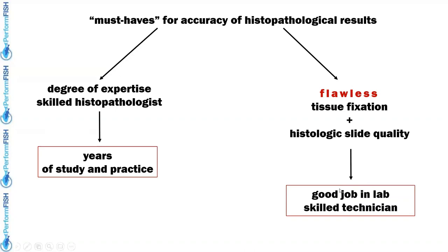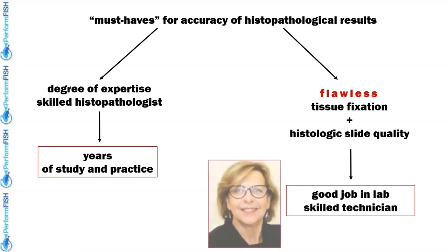And so it's very important to have flawless tissue fixation, good histological slides, a good job in the lab, and a skilled technician. And for our luck in the lab, we have Carla, the super skilled technician.